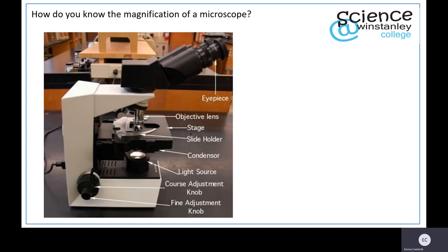So how do you know the magnification of a microscope? If someone has asked you to work out actual size and you need to know the magnification, you take the microscope you've been working with and find the magnification of the eyepiece lens. On this particular microscope it's times 10.